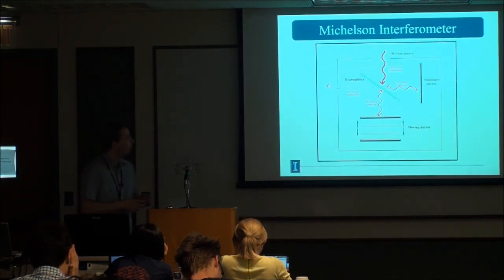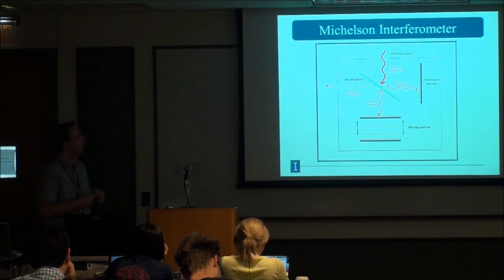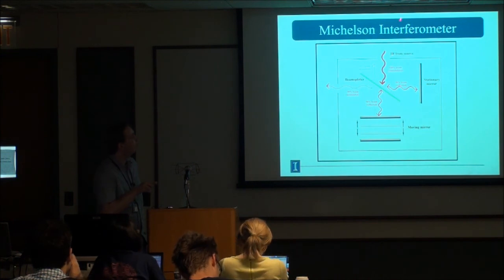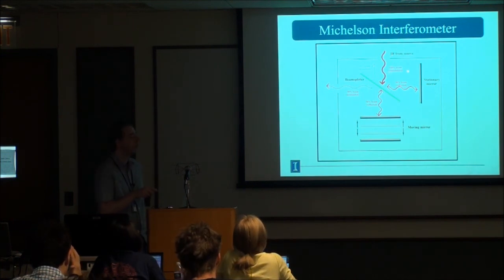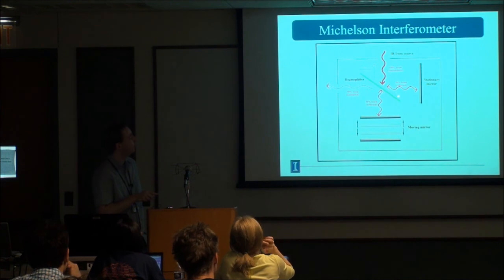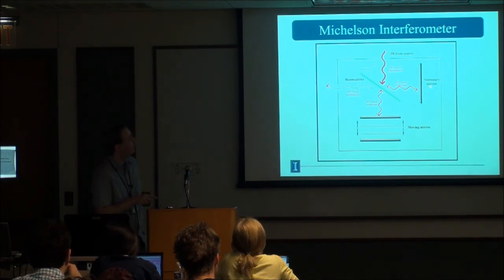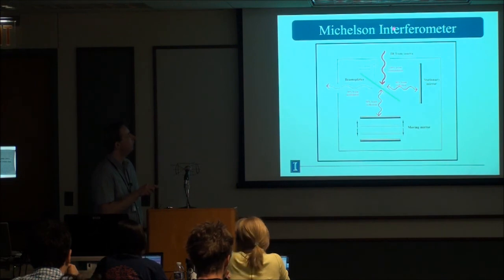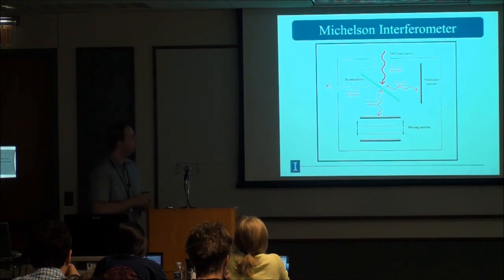Okay, so many of you will be familiar with interferometry. This is the FT part. Essentially, the infrared comes into your interferometer. It's split 50-50 by a beam splitter. 50% is reflected to a stationary mirror, 50% to a moving mirror. This mirror moves, so it creates a path difference. It then reflects and recombines. 50% is destructively interfered, and then 50% is modulated and goes into the bench. I'm not going to talk too much about FT. I'm sure you're all familiar with that.